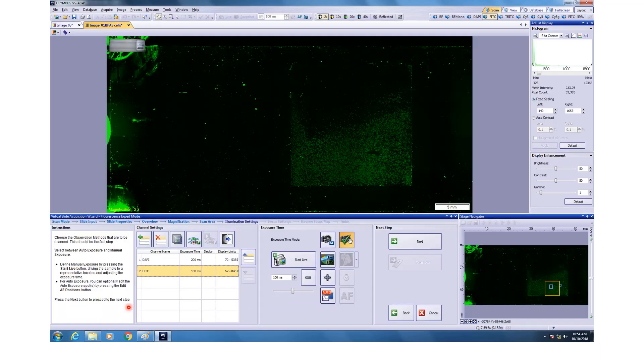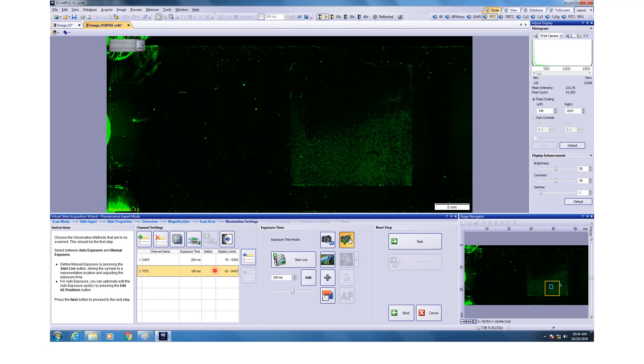And now it will ask which all channels do you want to image in. I have for this example taken DAPI and FITC. If you want to add more, you can click on this button and then you can add more. And if you want to reorder the positions, you can do this. That doesn't matter much but it's always good idea to image the most red color first and then the bluer because that will avoid photo damage.